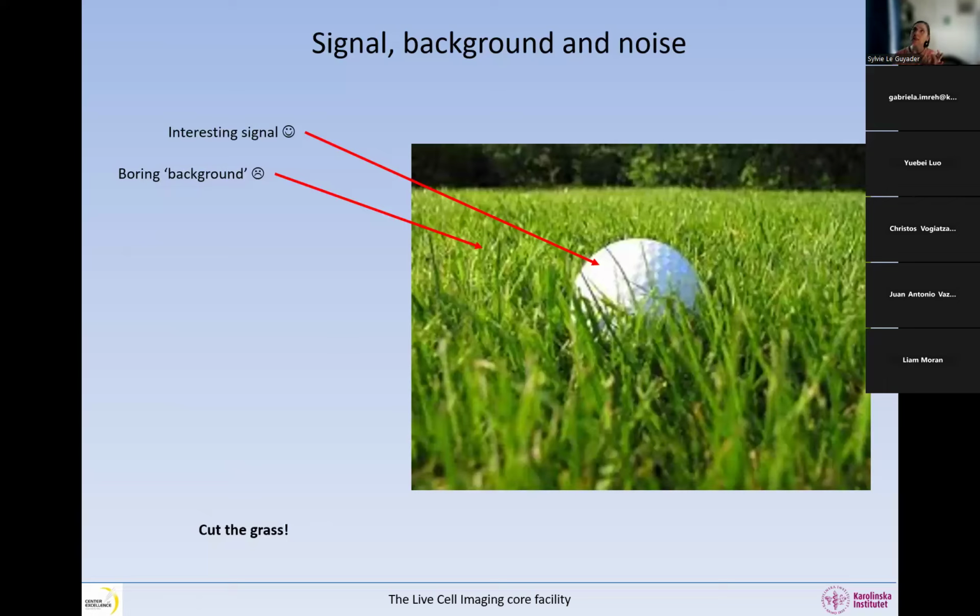But basically on the Zeiss system, it's called range indicator. On the Nikon system, I think it's called saturation and underexposure. I don't know about the Leica, but definitely you have that. And if you don't, you can also look at Fiji. In Fiji, it's called high-low, and I have this information in the Fiji instruction document, how to find this.